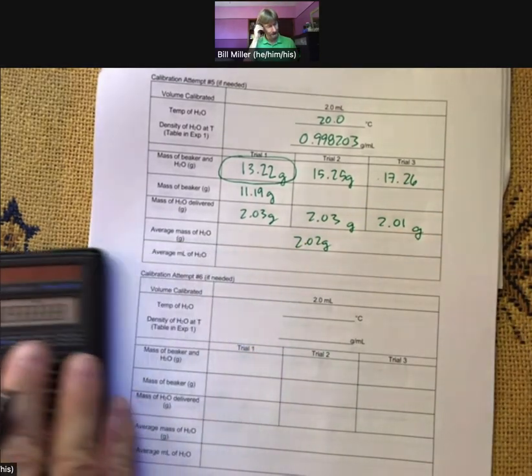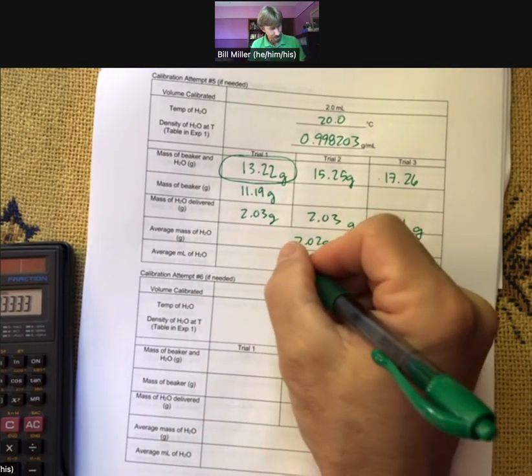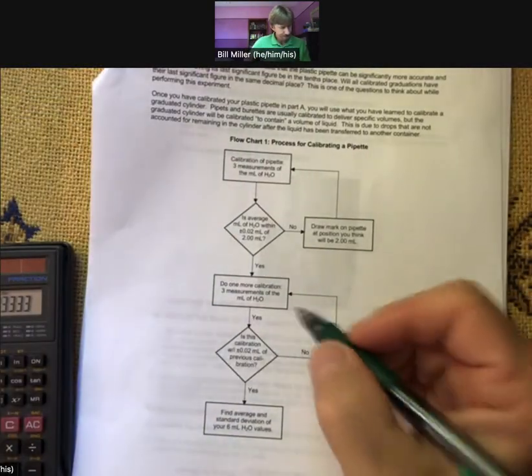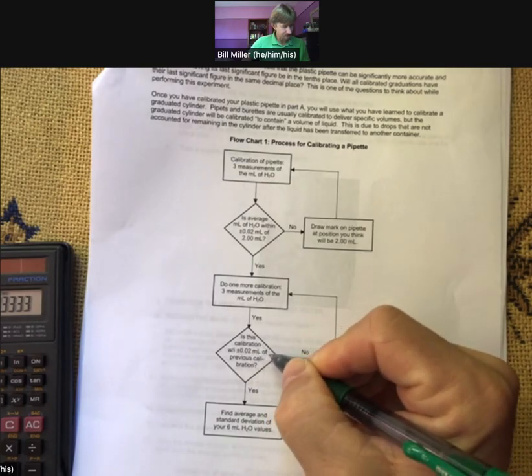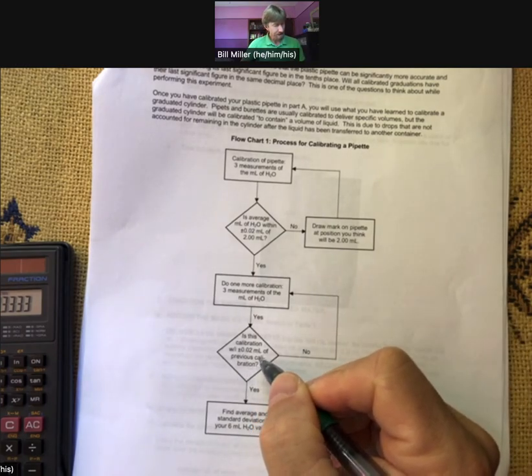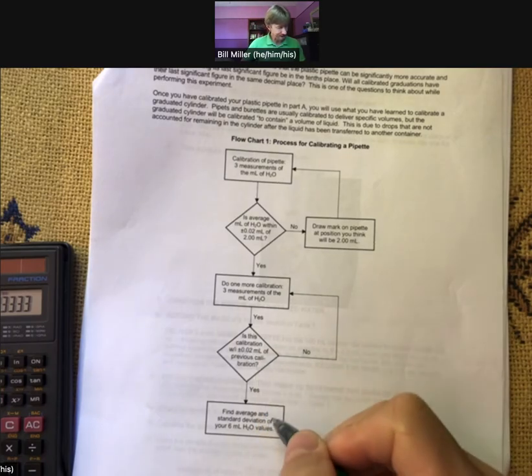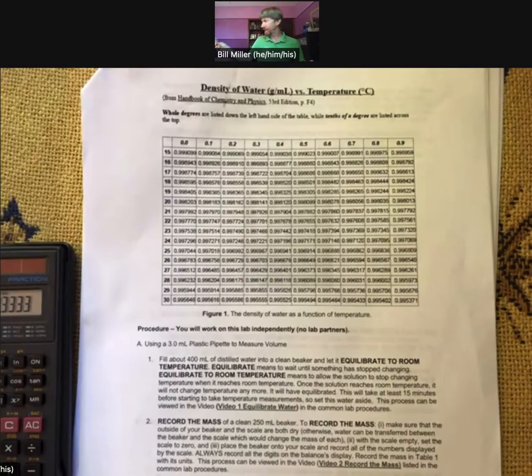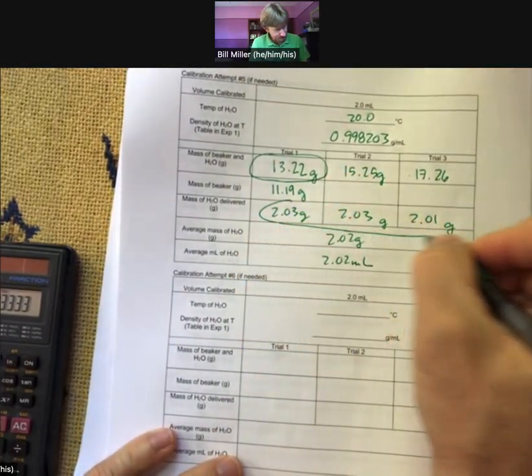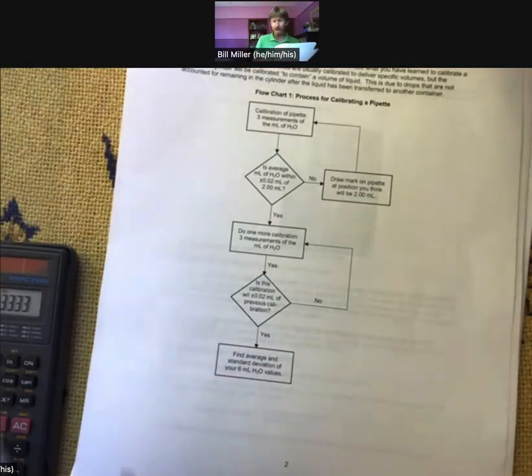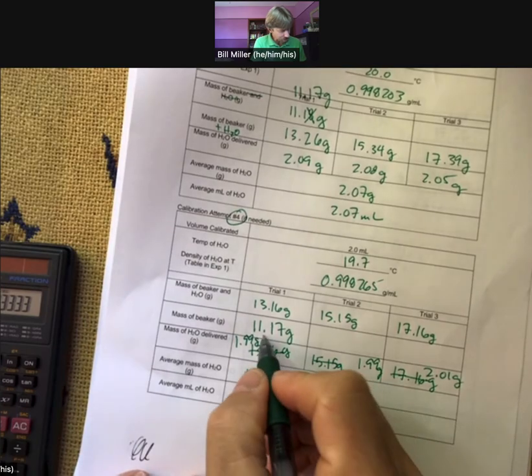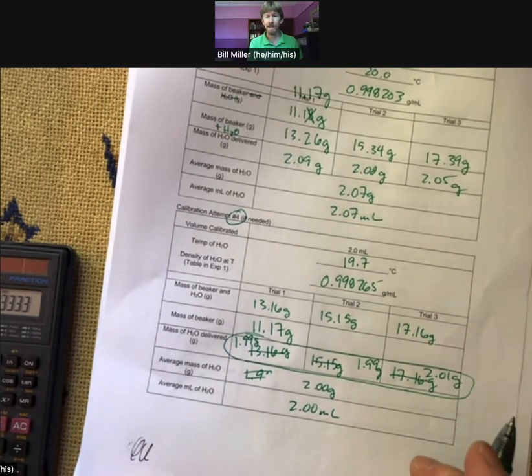It's a tight tolerance. The average is 2.02 milliliters. According to our flow chart: is the calibration within plus or minus 0.02 milliliters of the previous calibration? Previous was 2.00 — this is 2.02 — so yes. Now we are done. We have six good values: the three from calibration attempt five and the three from attempt four.